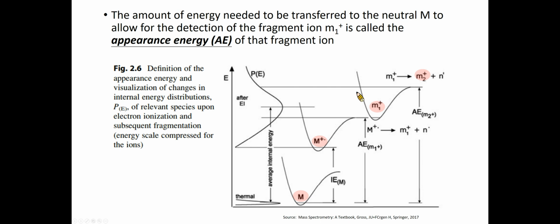Bond breaking is an endothermal process, and thus the potential energy of the fragment ion is usually located at a higher energy level. In fact, the ions are not generated by one specific internal energy applying for all ions, but via a broad energy distribution (PE). However, such a distribution is only valid for a large set of ions as each individual one bears a defined internal energy ranging from just above IE to well beyond 10 electron volts for certain ones.